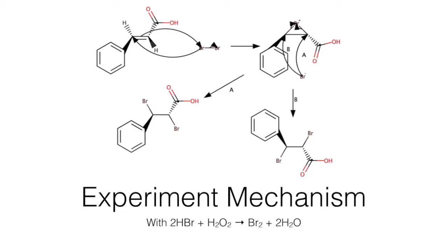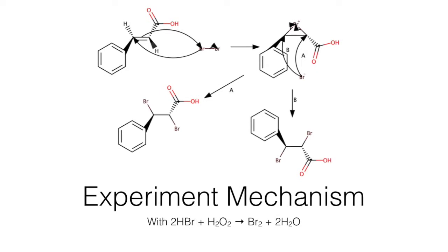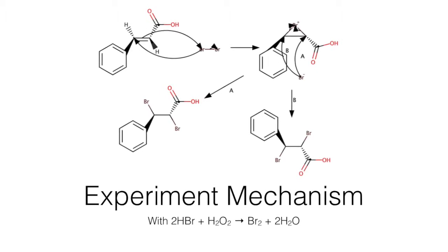Carbon 13 in DEPT 135 will show 4 signals for each carbon in a different environment. The DEPT 135 should have only up signals because all carbons are bonded to a single hydrogen.